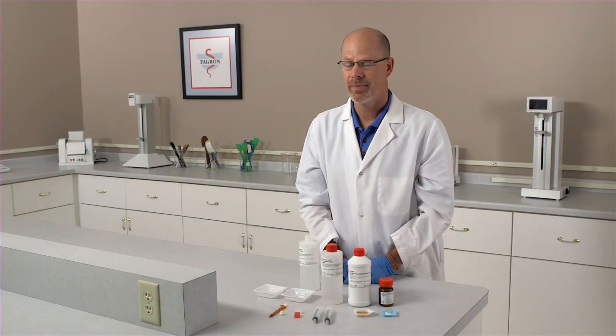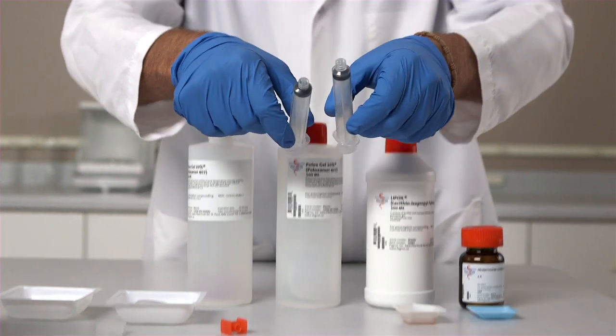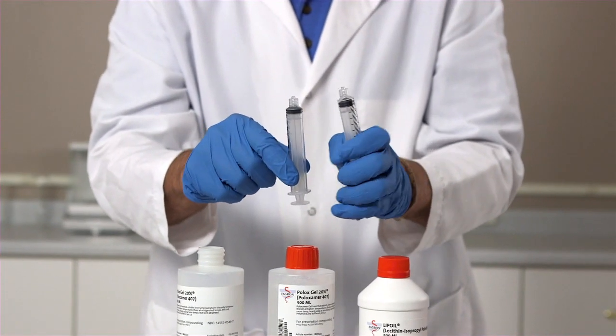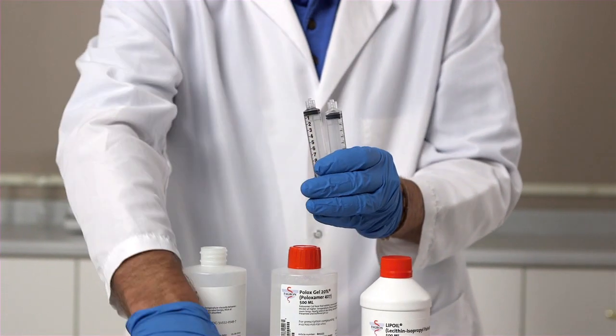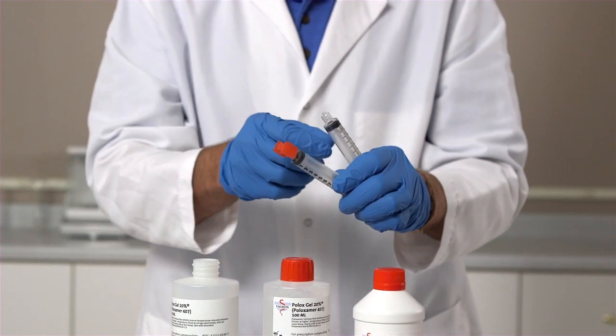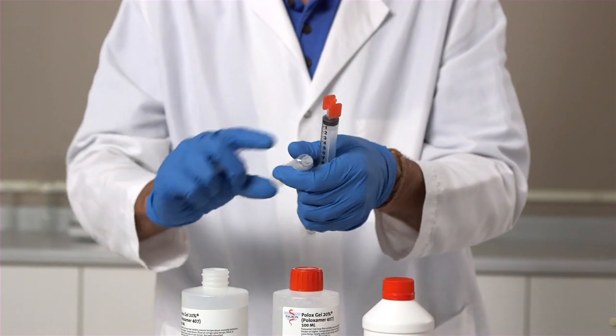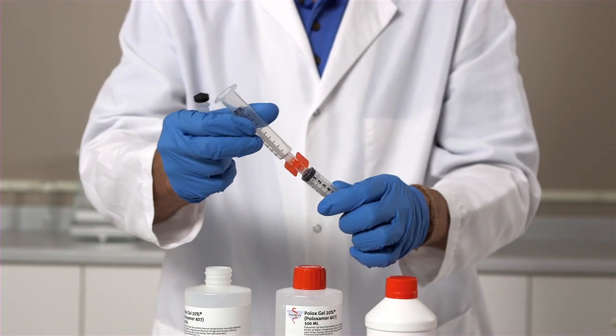I will now mix this preparation together using the syringes. The first thing we'll do is take our two luer lock syringes and the red luer-to-luer connector. Thread the device onto the end of the syringe.